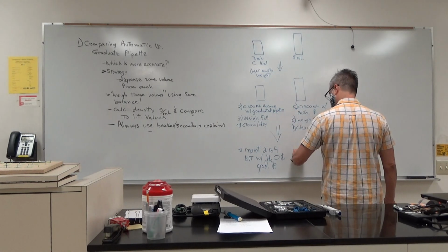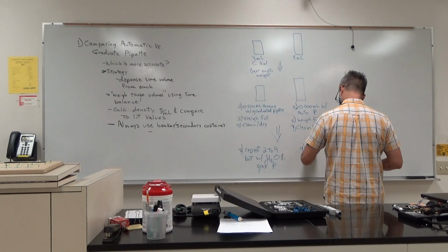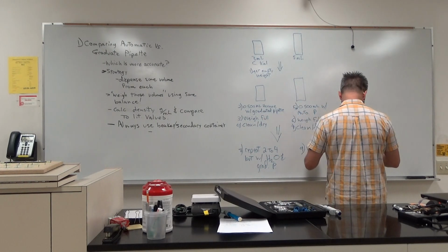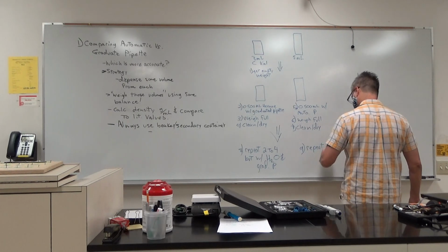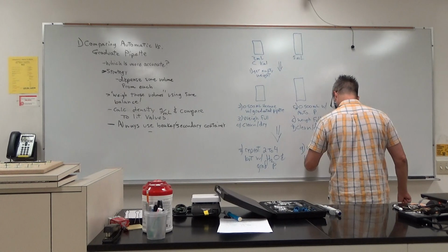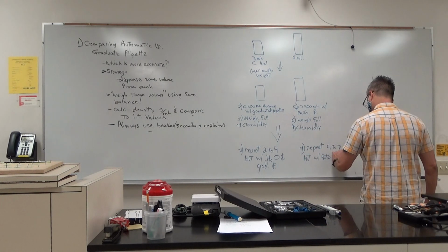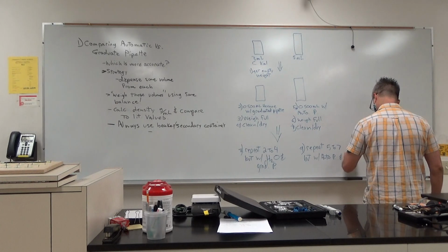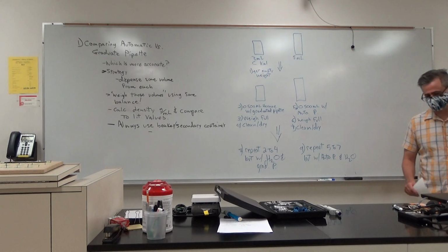And then step 9: repeat 5 to 7, but with the auto pipette and H2O. Okay, does that make sense?